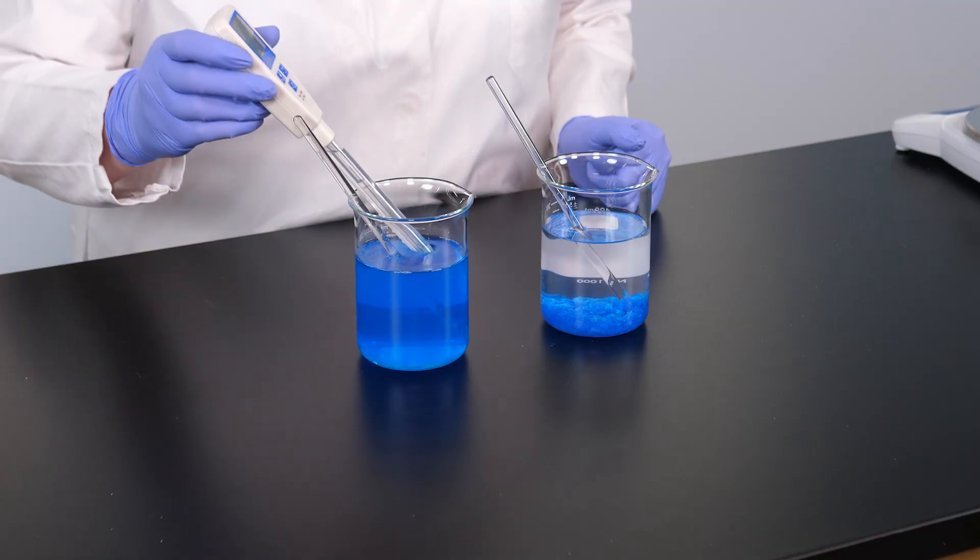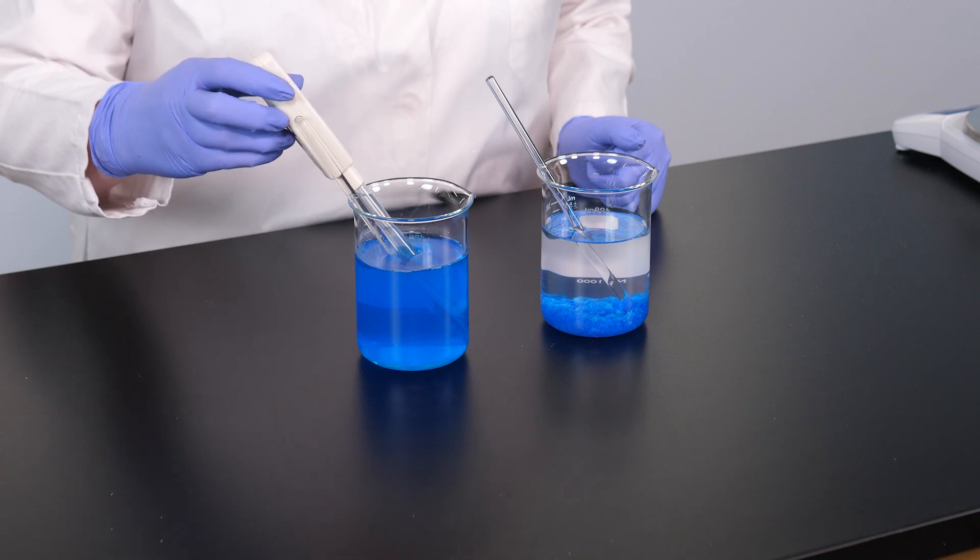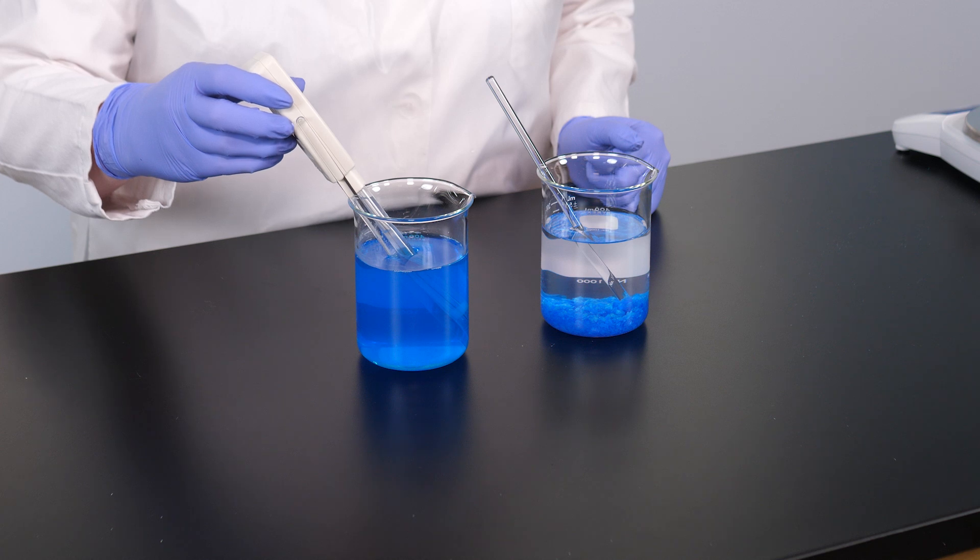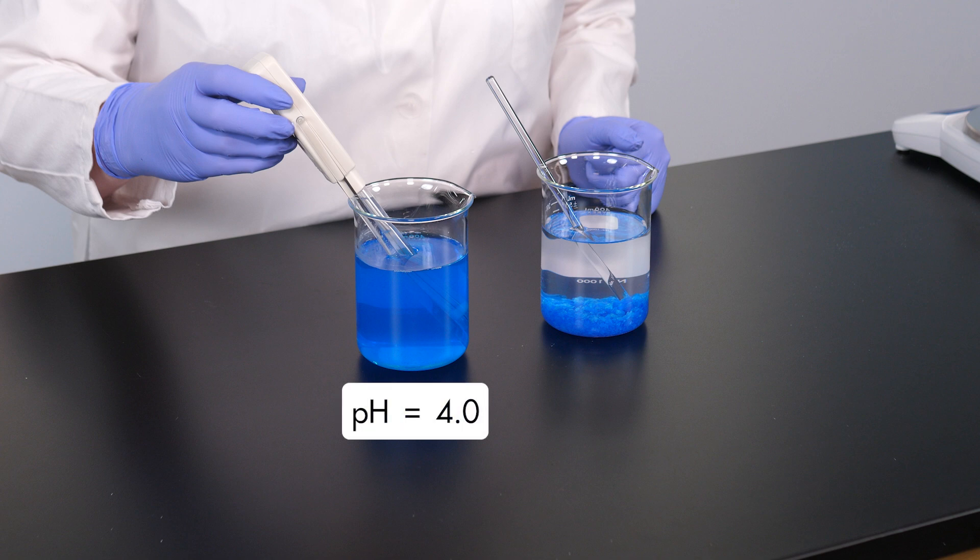Now, let's test the pH of the solution formed by dissolving the substance in water. We determine pH with a pH meter. The pH of the solution is 4.0, which is acidic.